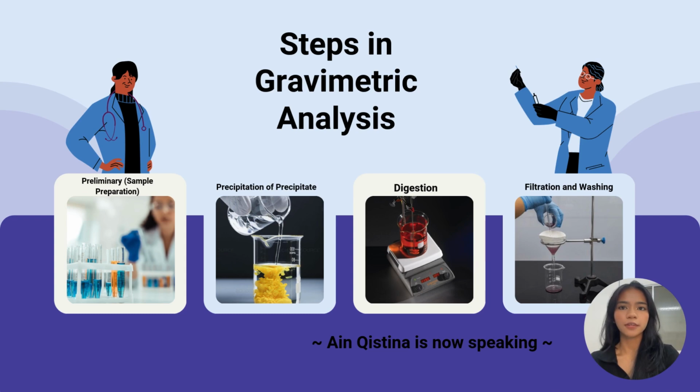Preliminary, also known as sample preparation, is a process to prepare the pharmaceutical sample in a form suitable for analysis. The pharmaceutical sample, such as a tablet or solution, is dissolved in a suitable solvent to ensure that the API or the target component is in solution. In some cases, the sample may require preliminary treatment, such as filtering, heating, or acid-base digestion to eliminate interfering substances or to ensure complete dissolution.